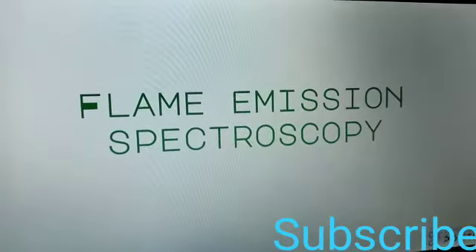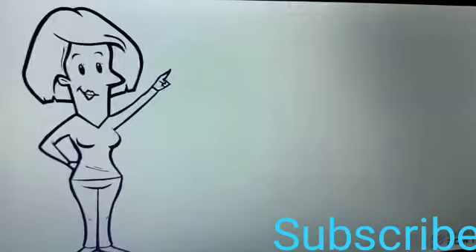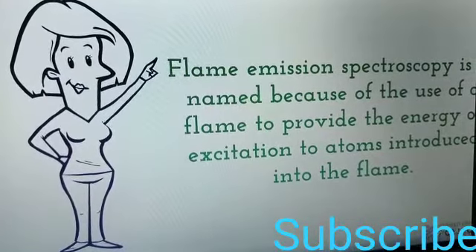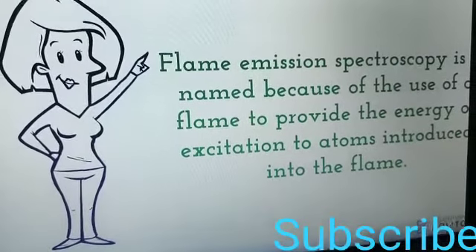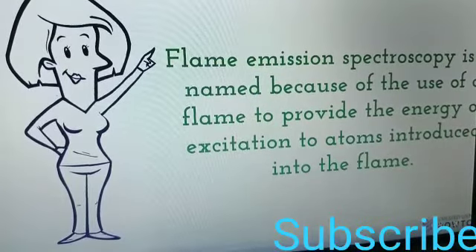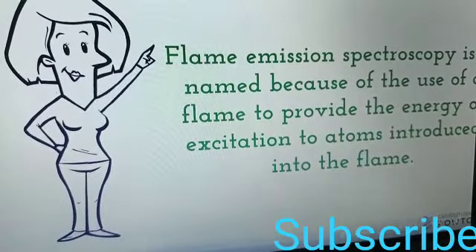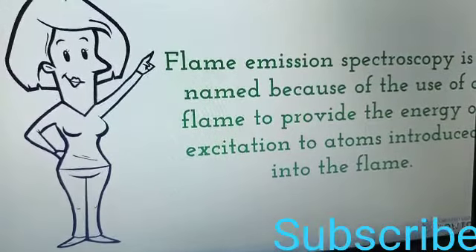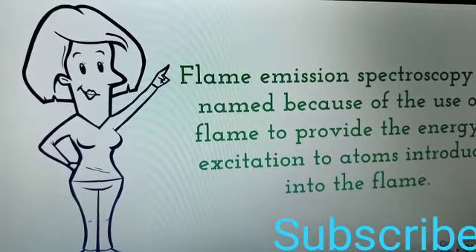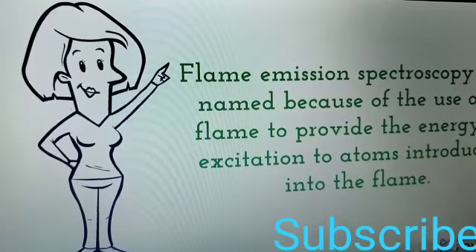What is flame emission spectroscopy? Flame emission spectroscopy is named because of the use of flame to provide the energy of excitation to atoms introduced into the flame. In this form of spectroscopy, the excitation source is flame. That's why this type of spectroscopy is called flame emission spectroscopy.